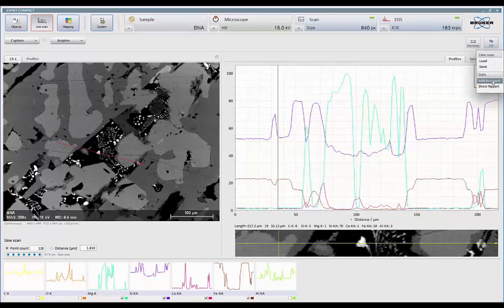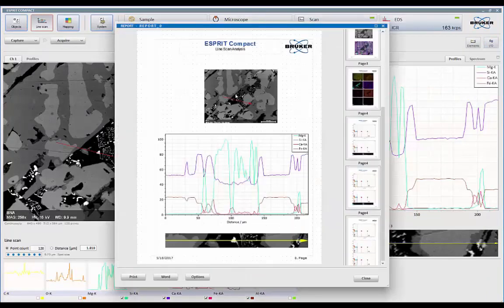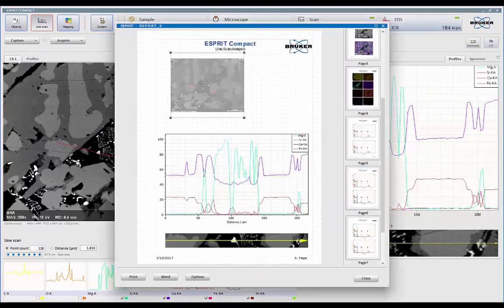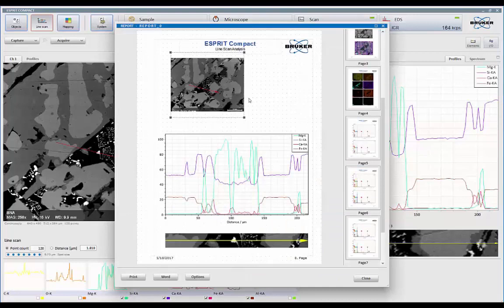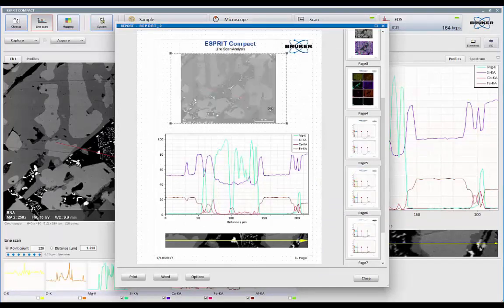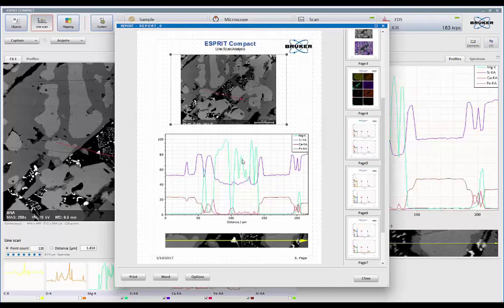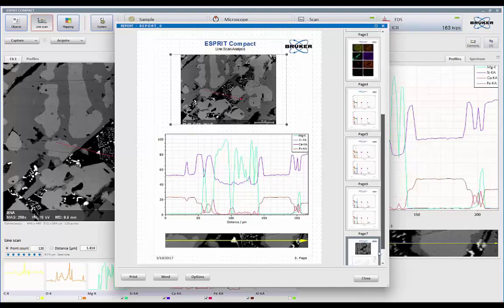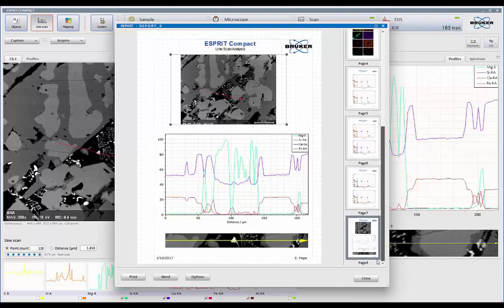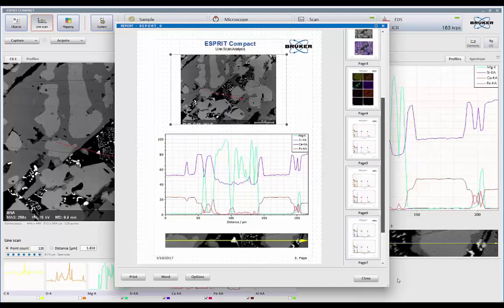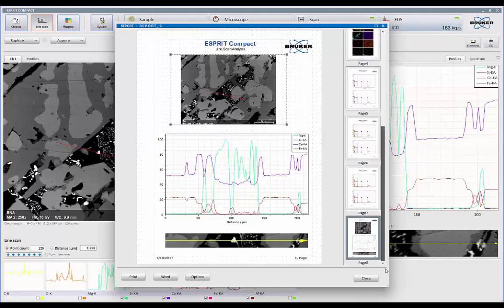So I simply say Add to Report. And now I've got my image showing the vector where we collected it from. And I can adjust that. And then I have my zoomed up image down here with the corresponding vector right on top of it. And that's now just been added to my entire report. So now I've got an eight-page report. And if I want, I can then say, well, let's put that out to Word.